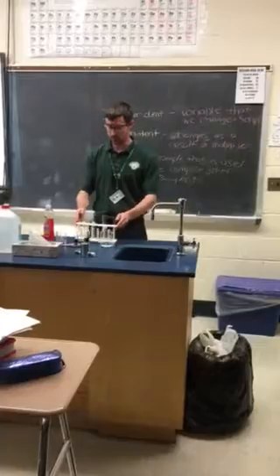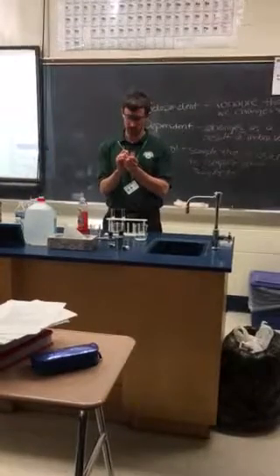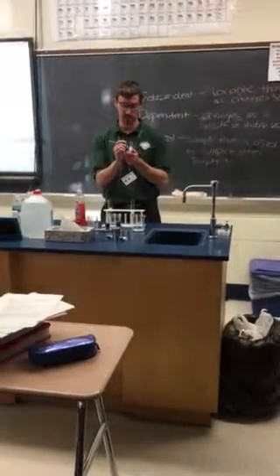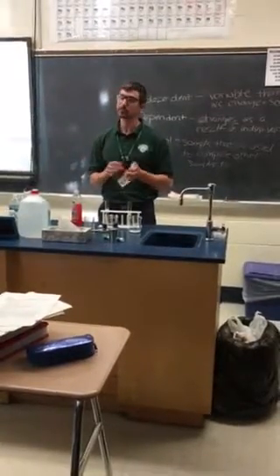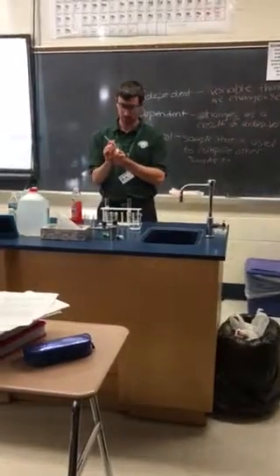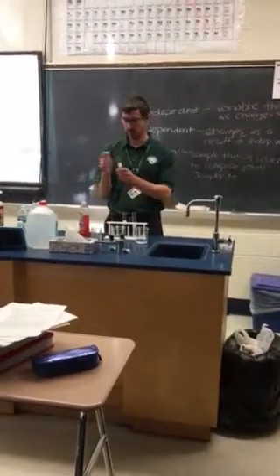So I'm just going to label my test tubes. This is town. The benefit of having multiple people in a group is you can share these duties. So one person can be handling the samples, another person can be handling the test tubes, another person can be recording. This is our control. And then our distilled.